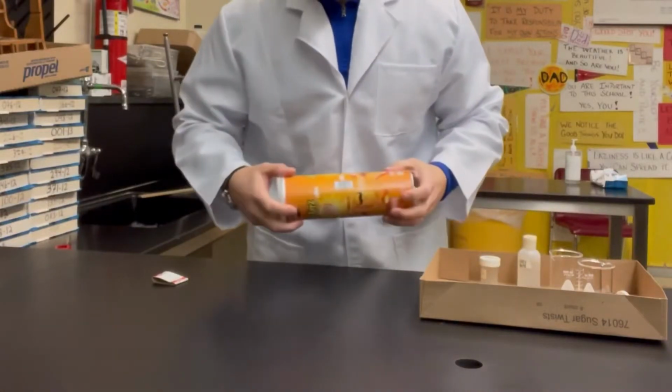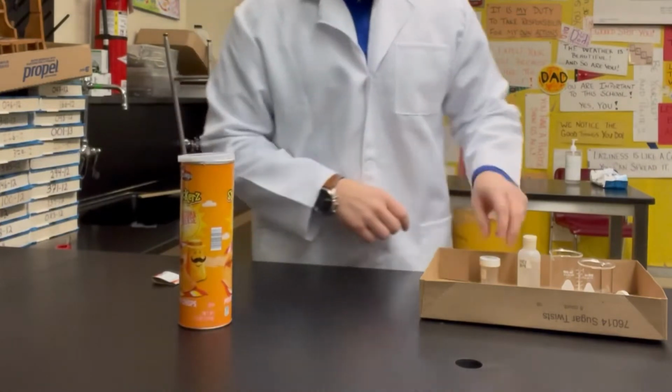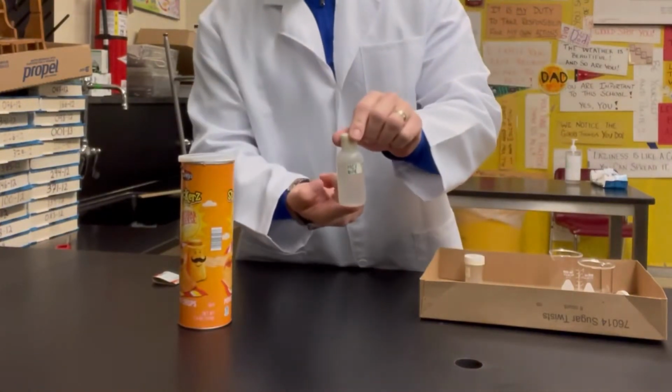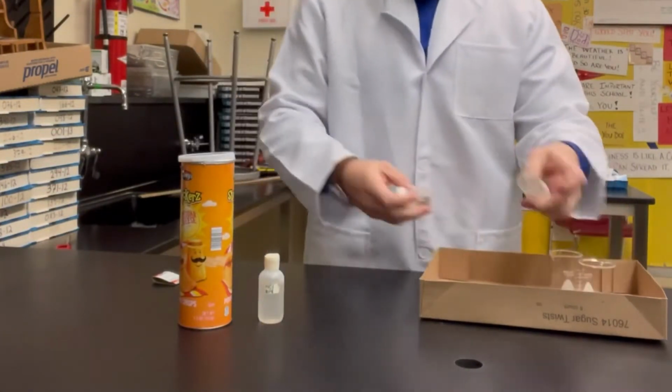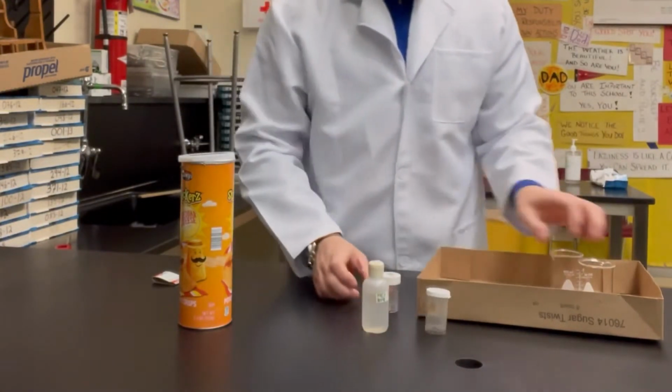All right, today we're going to be looking at a single replacement reaction. So I have an empty potato chip can, I have 6 molar hydrochloric acid, and I have pure zinc. What I'm going to do is a single replacement reaction.